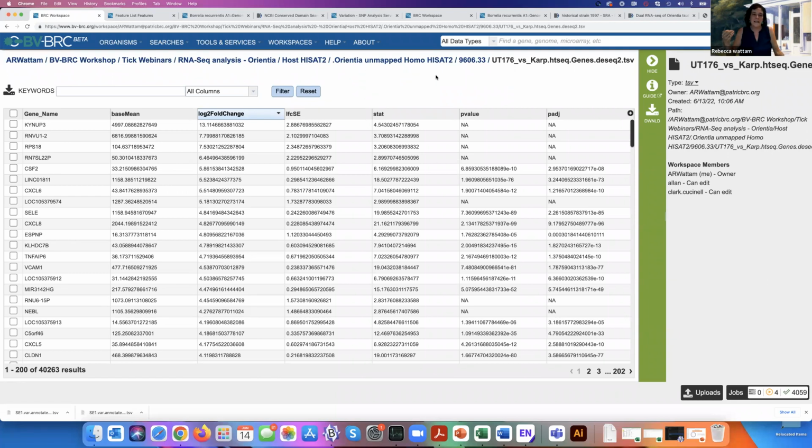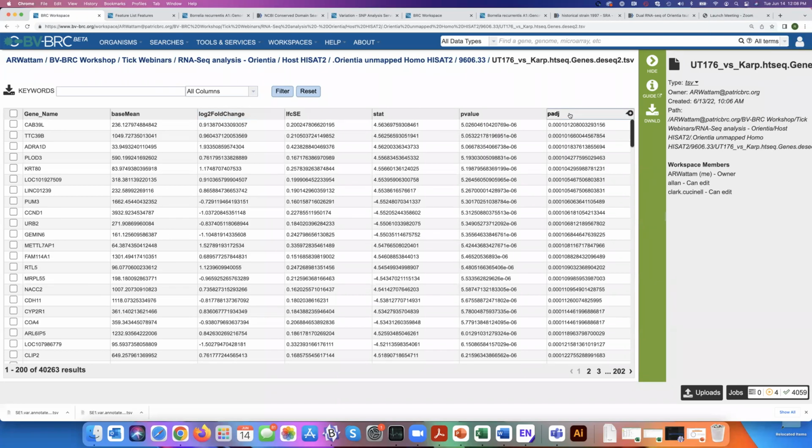It might be nice to be able to move to that other interface that we had for the bacterial genes, where you could filter on fold change and keywords and this and that and the other. Yeah. But we don't have that for this yet. In this case, obviously one would want to filter or sort on fold change, but also a second sort on the adjusted p-value, just to see what is actually significant out of the ones that are differentially regulated. But you can do that in Excel, which is not a problem. Yeah, you can always do it in Excel, but it's a big Excel file too, with all of those genes.